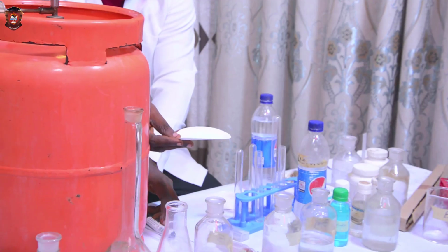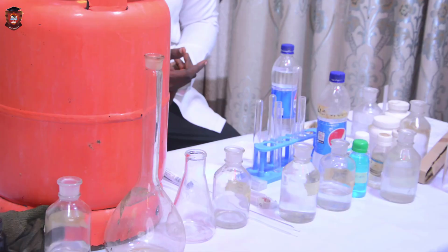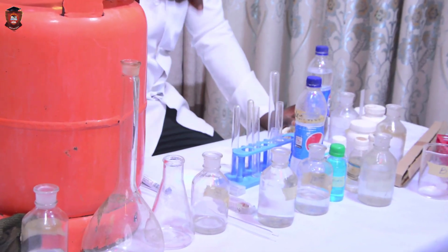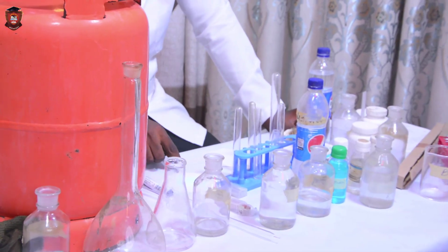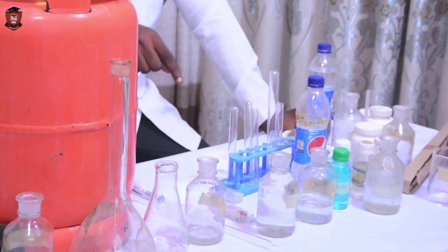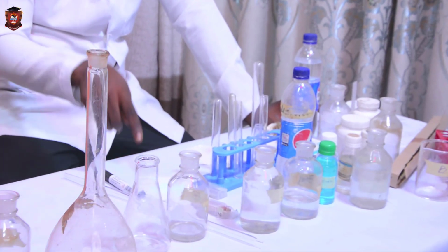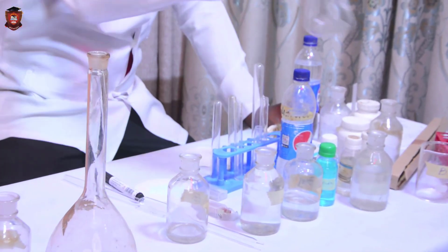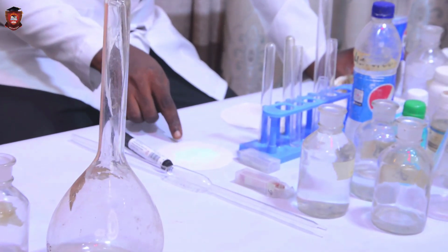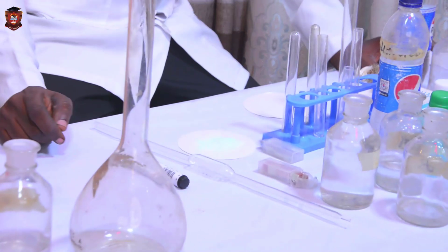That's copper 2 sulfate, copper 2 tetraoxosulfate 6, and then glucose. So we are to identify ions in this sample. In fact, what we are identifying here is copper. We also will identify sulfates, and we also will identify glucose in this sample.